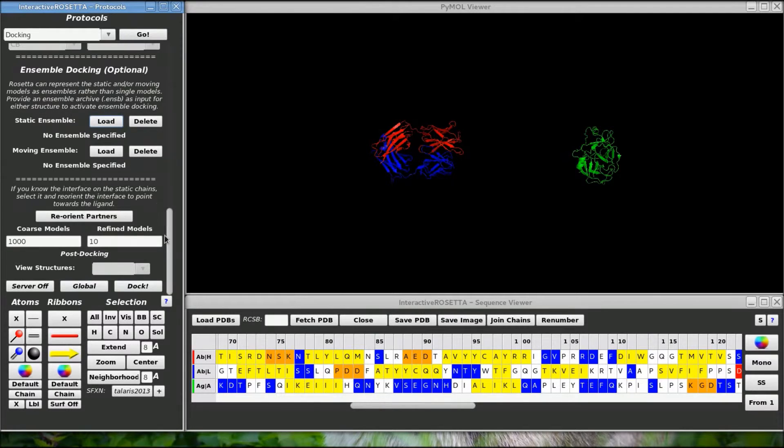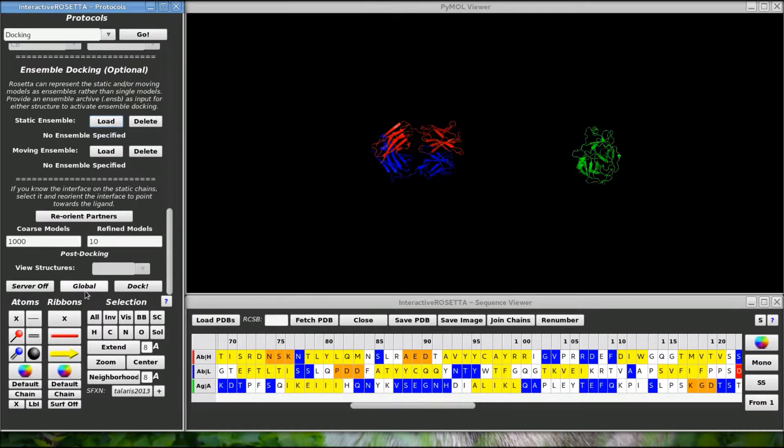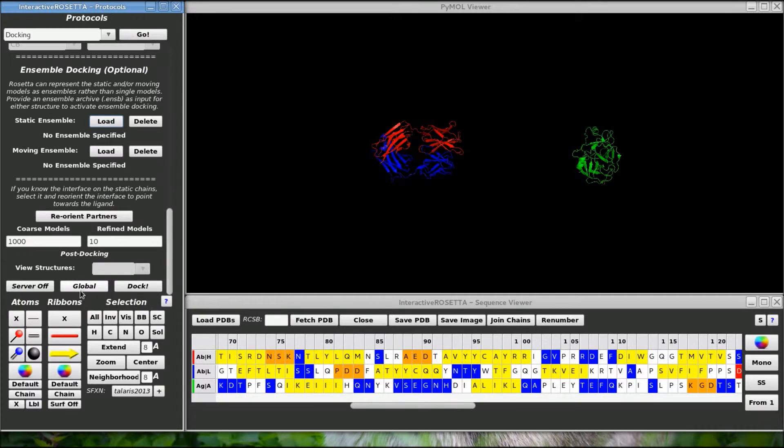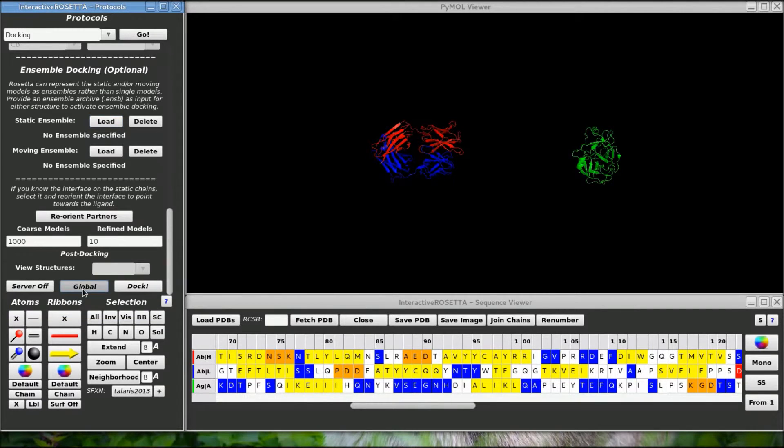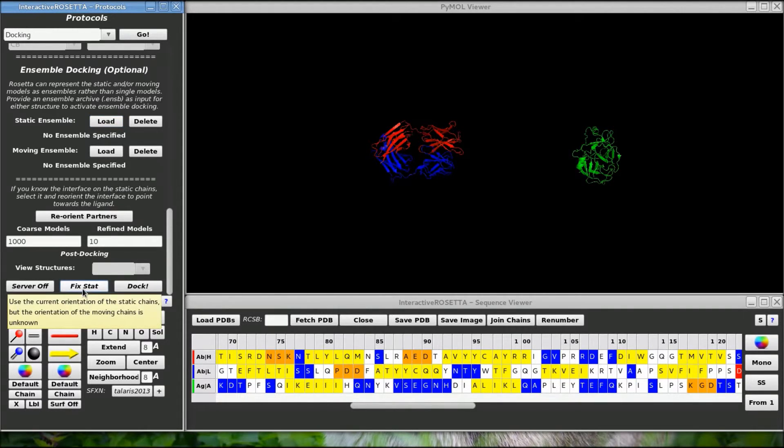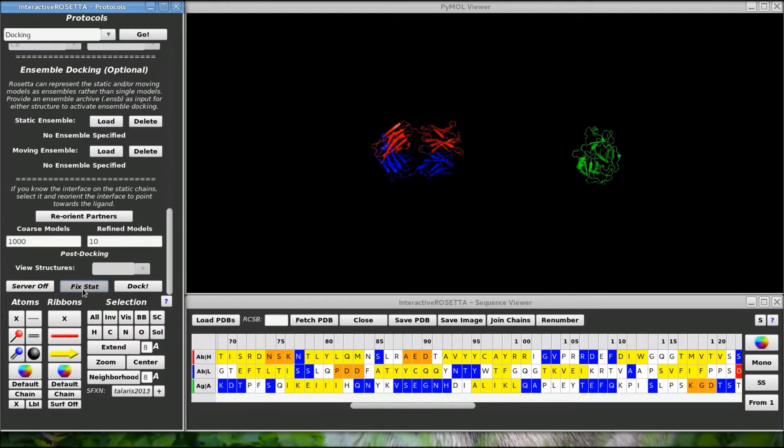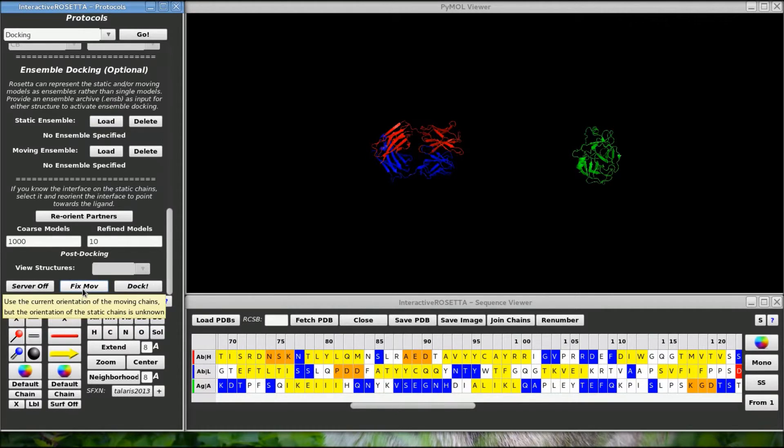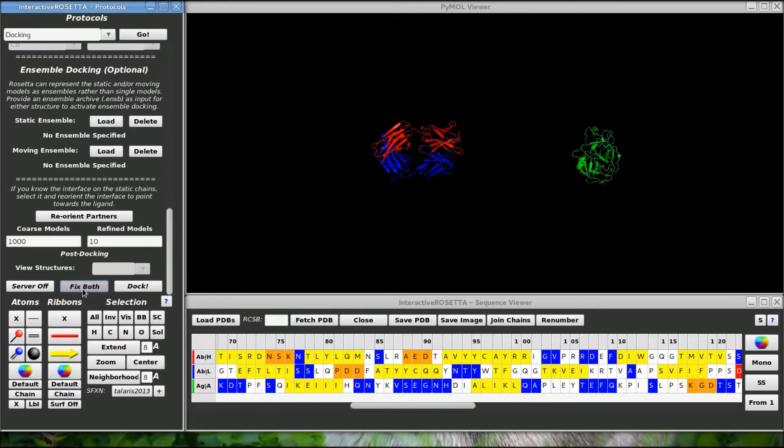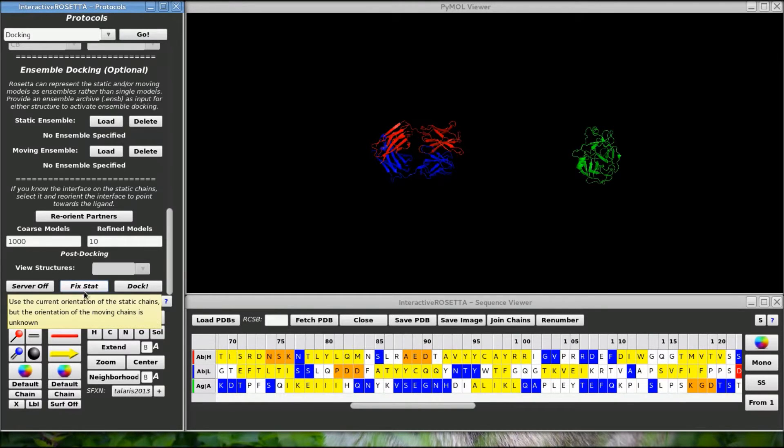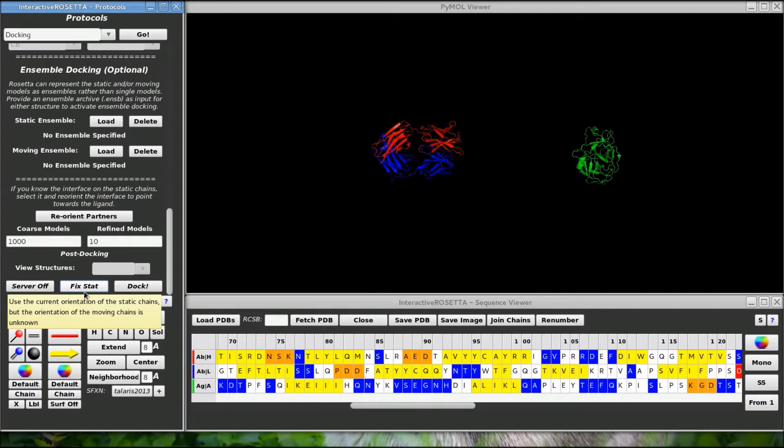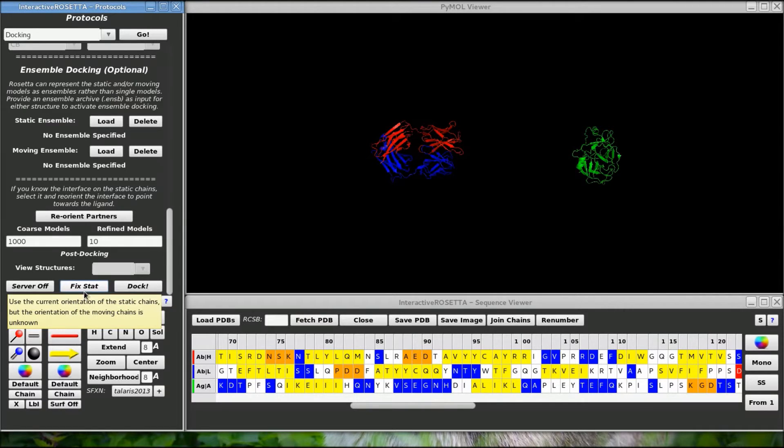The last step is to tell Rosetta whether one or both of the docking partners will start with their orientations randomized. Global means that both partners will be randomized. This means that the static group will not be randomized. This means that the moving group will not be randomized. This means that neither will be randomized. Since we know that the current antibody orientation is near correct but the antigen orientation is unknown, I'll fix the static structure. Even though it is fixed, there will be some minor perturbations on the antibody to wiggle it into place with the antigen, so it is not 100% fixed.